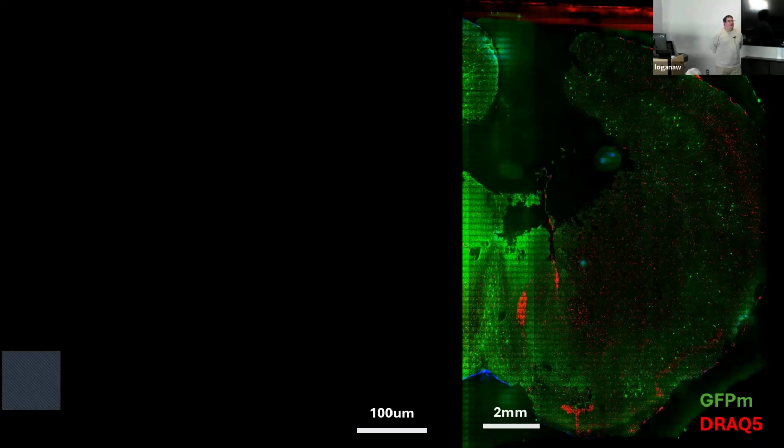So the answer is that for these really long experiments, we use, I forget what the compound is, but it's kind of like super glue, but biological super glue. It's a polylysine mixed with something else. You stick it onto the glass, and then when you put the tissue down, it sticks down like a glue. You can turn it upside down and it won't fall off. And then on top of that, we put a little acrylic box around it, with a glass cover slide on top, and we sandwich it all down with glue.